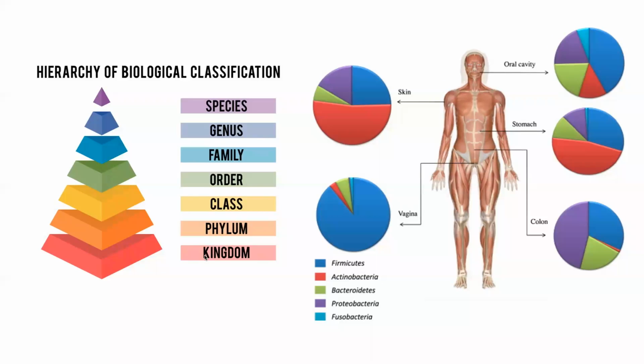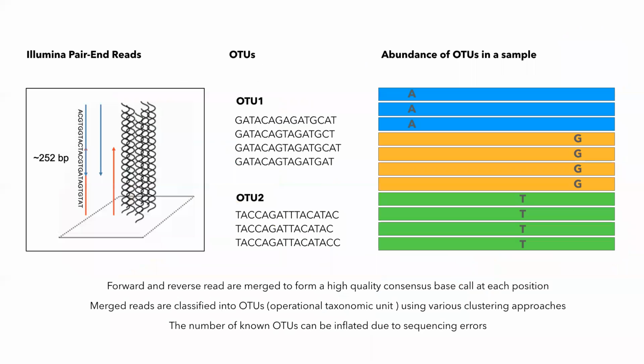Okay, so a question really quickly: what are paired end reads? As you see right here, individual reads are short segments of sequences. So when we say shotgun sequencing, it refers to shattering the DNA that we have. Typically, those pieces are then sequenced, and so we have this digital information about each read.